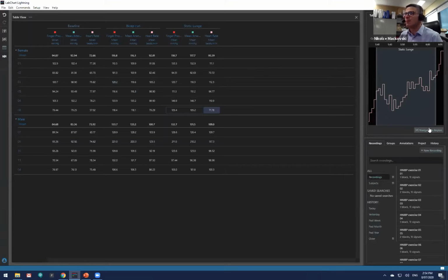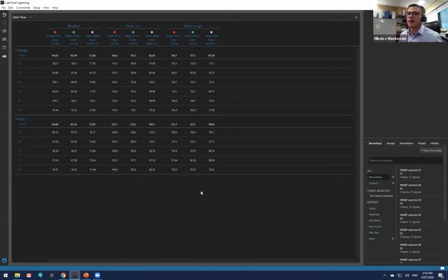So now let's talk more about the table itself. What can we actually do with this data? So what we see is the mean, which is great. That's really cool, but what if we want more calculations out of this? What do we do? The first thing we want to do is press these three dots here, show properties. By clicking on show properties, we are given these table property views. So what these will do is two things. Either A, it can show us more calculations, or B, you can actually hide some of your data.